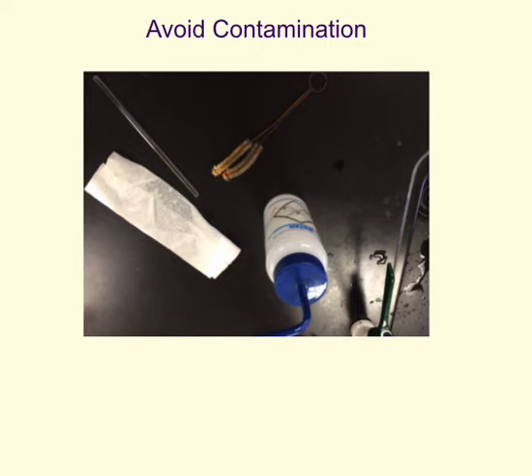Okay, so now I'm following along in my lab where it's still on page 1, I guess, where we're starting with avoiding contamination. So this is just an upside-down picture that is showing us how we need to make sure that we don't have contamination enter our lab. This is going to be a great concern when you're working with your unknown, especially, because you don't want false positives. You don't want to get some sort of indication showing that you have some ions in your solution that you don't truly have in your solution.